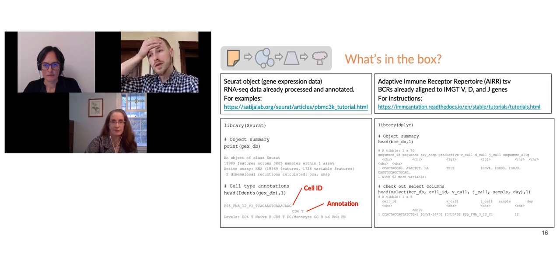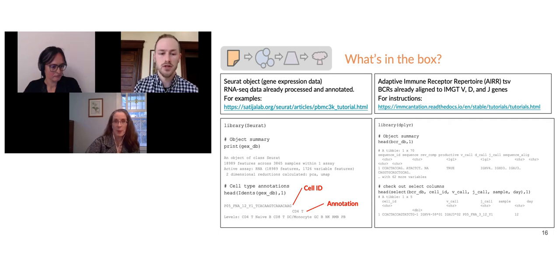If you go to the Dowser website, it has vignettes walking through a data set that is essentially all heavy chains, so it's basically bulk sequencing. So for bulk, you'll probably have more luck looking at the Change-O documentation.